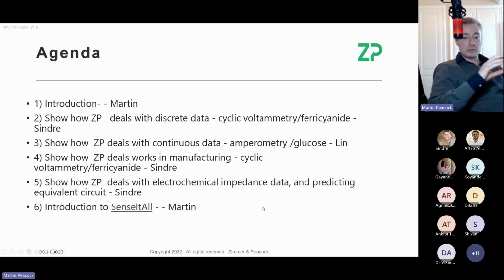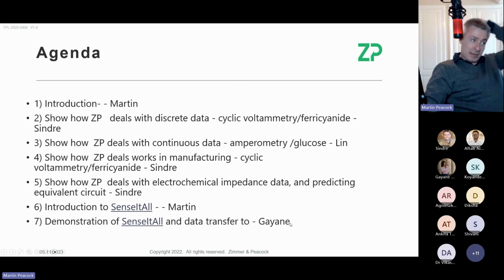And then we showed you that we can automate this process of recording voltammetry, sending that voltammetry to the cloud, turning it into a meaningful number, be it parts per million for the ginger or Scoville heat units for capsaicin, and then we were able to send it back to the app.